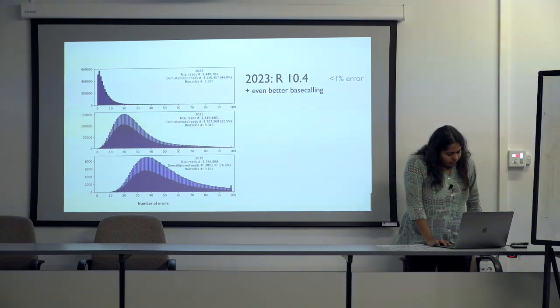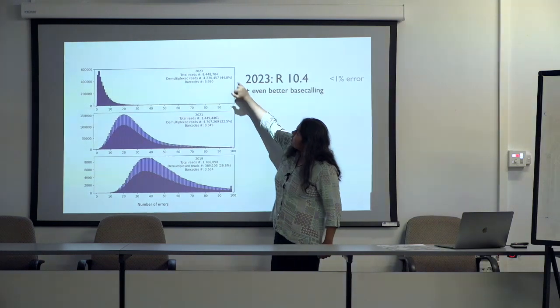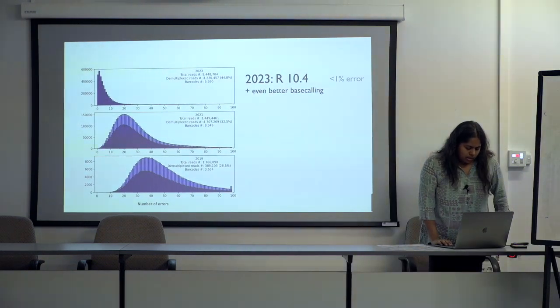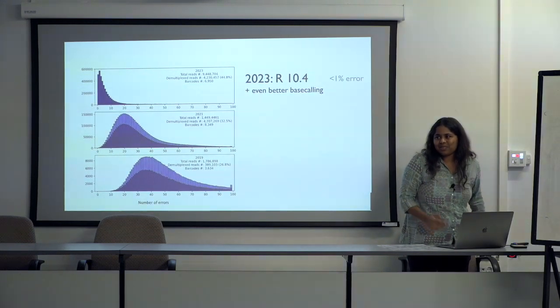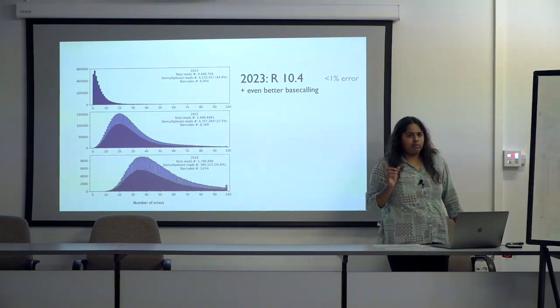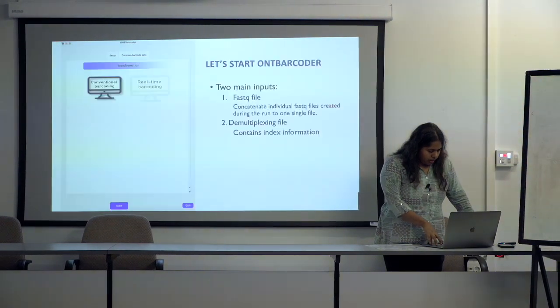And you can also see distinct improvements in demultiplexing rates. So we are routinely hitting about 50% demultiplexing rates these days, which is, I think, also interestingly what I observed in today's data set. So it'll be nice to see. I think partly this is also driven by the models of basecalling that are becoming available.